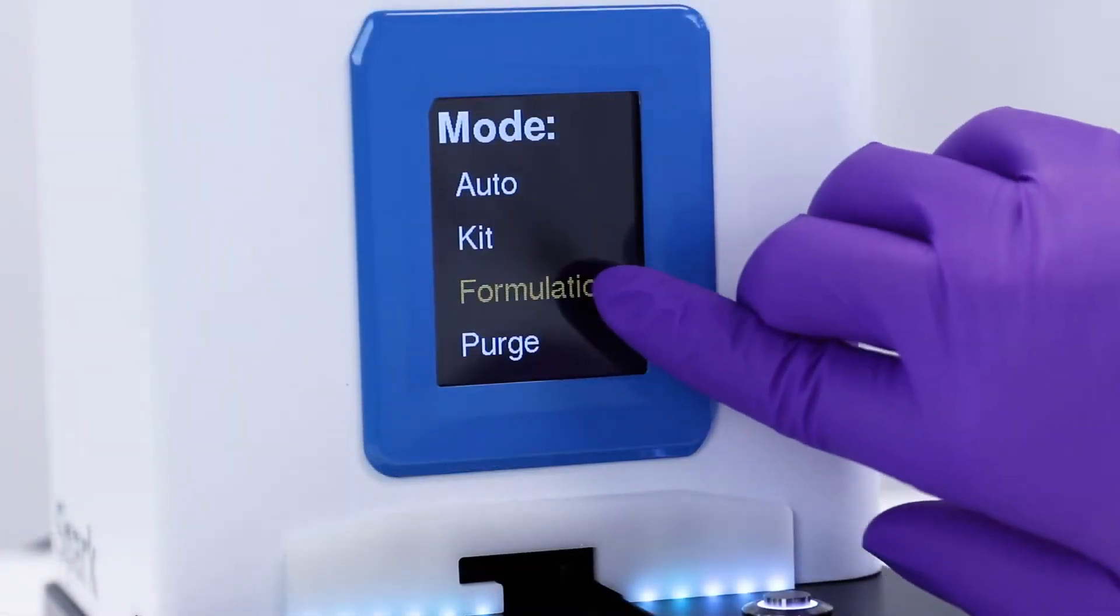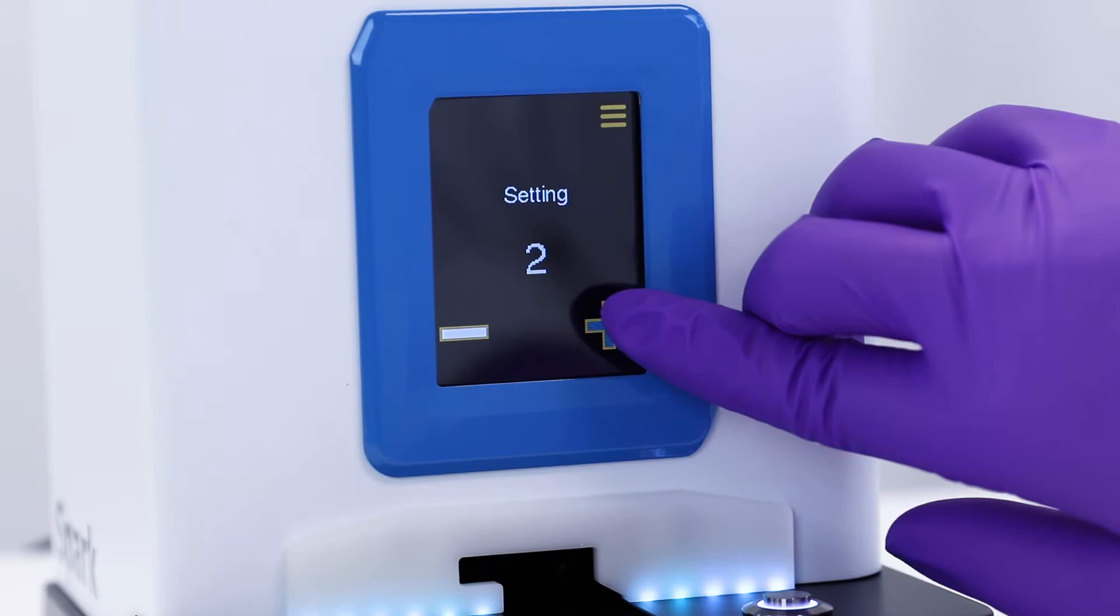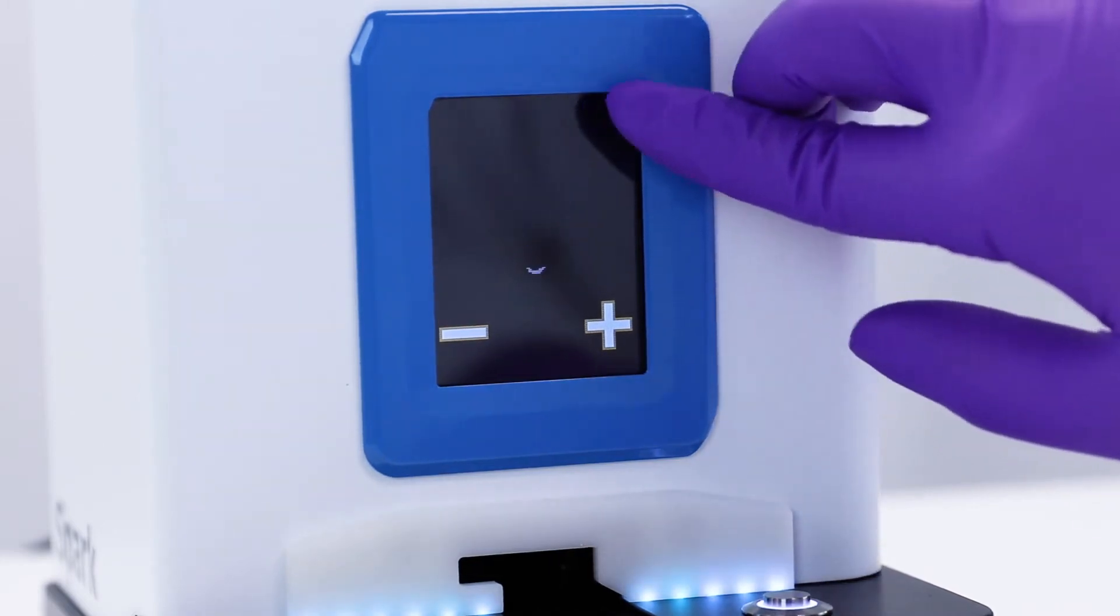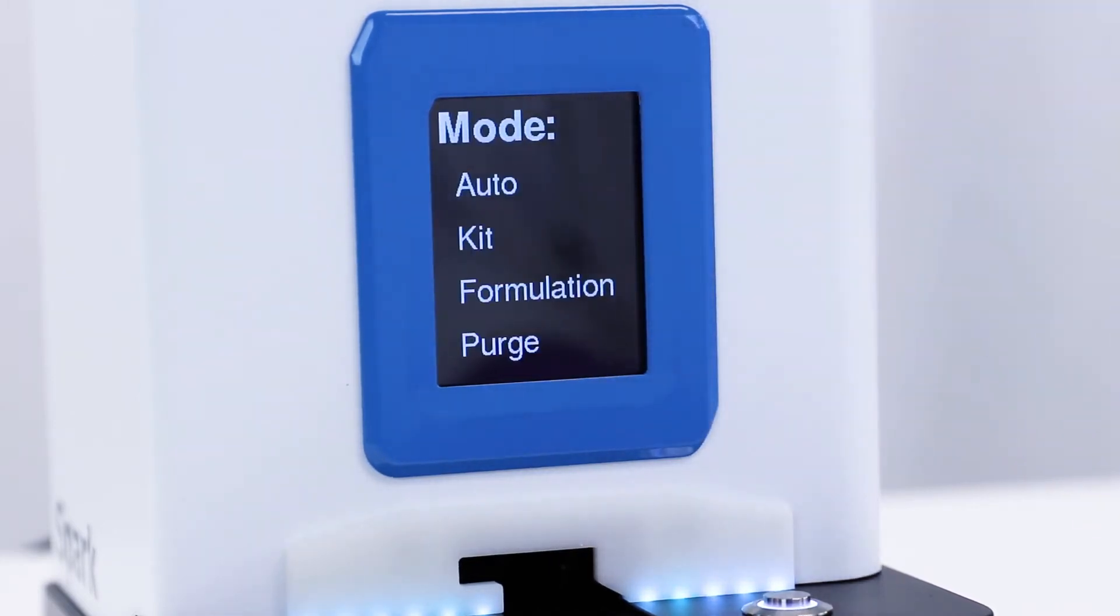Formulation Mode allows users the flexibility to select settings suitable for formulations of different volumes and to optimize settings for their materials. Some Spark kits use Formulation Mode, so check your Spark Kit User Guide for details.